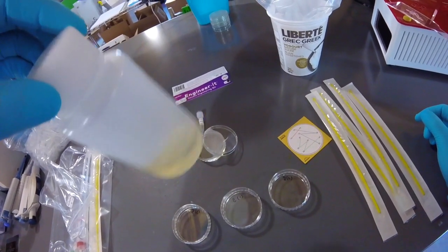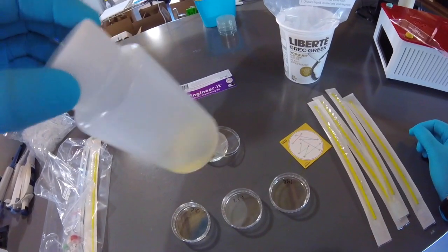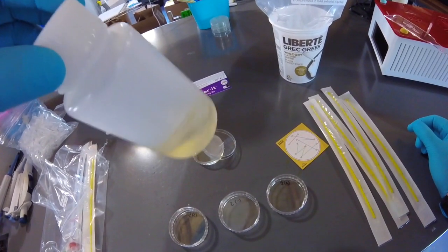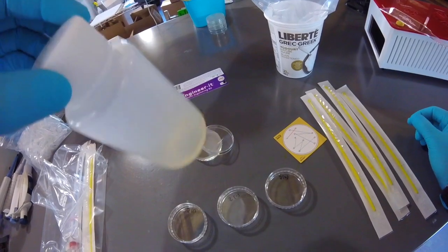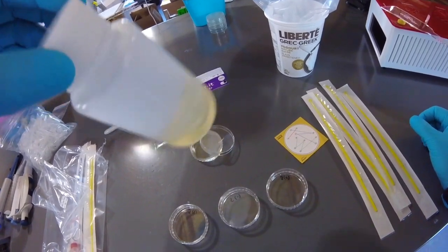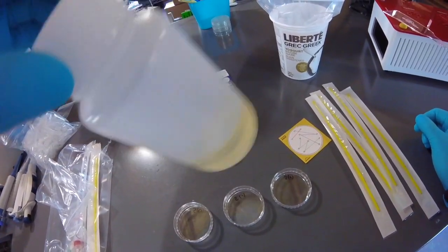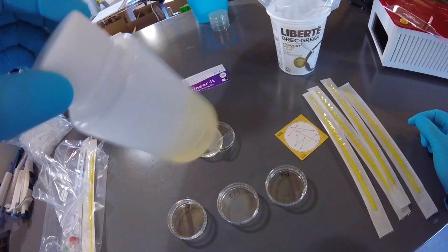It'll take a couple of minutes for this to dissolve, and the important thing is that the internal powder within this capsule dissolves. You might still see some gelatin capsule floating around, but if all the inside is dissolved, you're good to go to pour the rest of these plates.